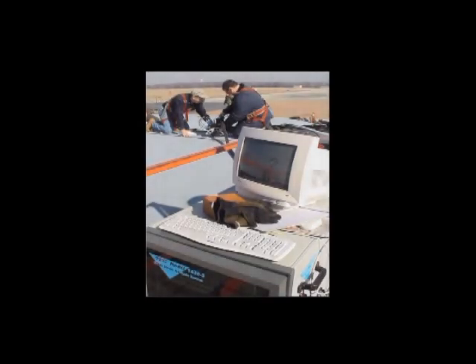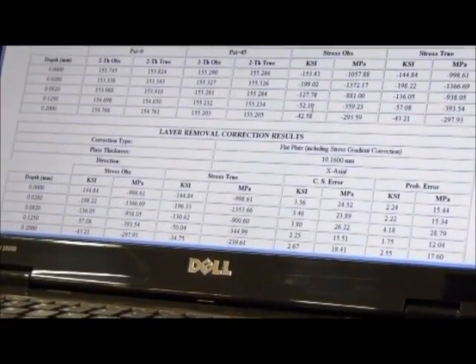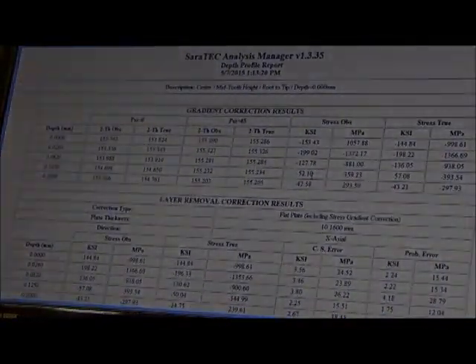What we can do is identify the potential for failure during the manufacturing process and before your product goes into service. The X-ray diffraction technique is a good non-destructive technique for measuring your part before, during, and after service. It can also be an excellent process control, quality control tool. We can also use it to validate designs. We also offer 9 robust algorithms for doing peak fitting, so you have your choice of how you would like your precise data to be analyzed.